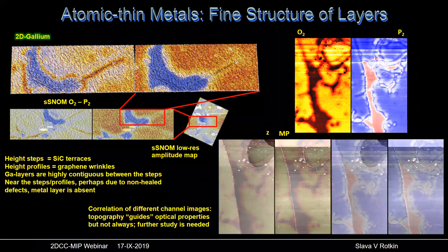Excellent question. So I'm sorry. The scale bar on that image is, I think, 5 by 12 micrometer. That area was larger, I think something like 20 by 13 micrometer. And this area is, as far as I remember, 1 by 4 micron. The frequency of the excitation is around 6 micrometers. I can give you a more accurate frequency later, but it's about 6 micron, maybe 6.5, something like that.